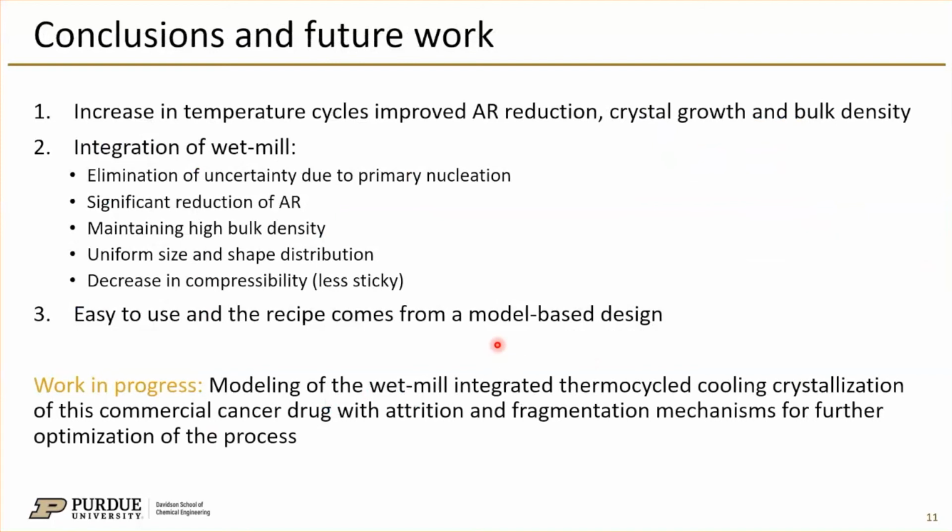So in this work, we demonstrated the positive effects of wet mill integration in thermocycle crystallization experiments of a commercial pharmaceutical ingredient. This proof of concept study was based on a previous model-based optimization work on wet mill integrated systems, and results demonstrated that the model-based guidance indeed provided an optimum solution and improved the crystal size and shape properties as desired, while maintaining desired bulk properties.